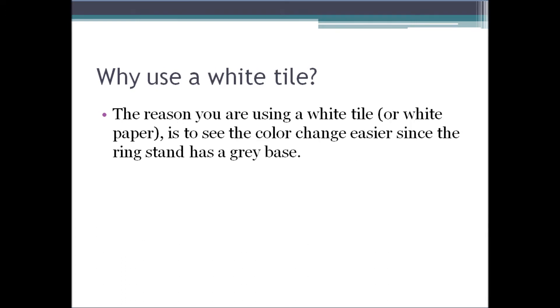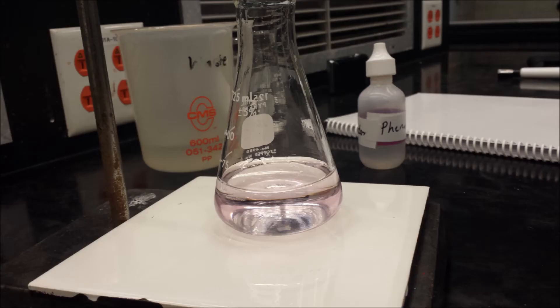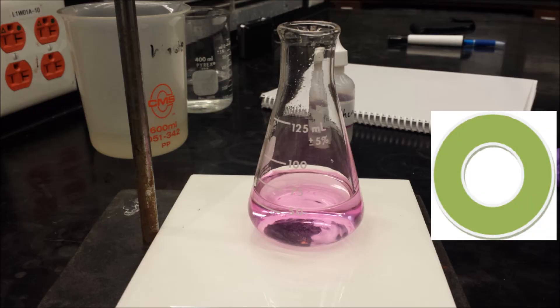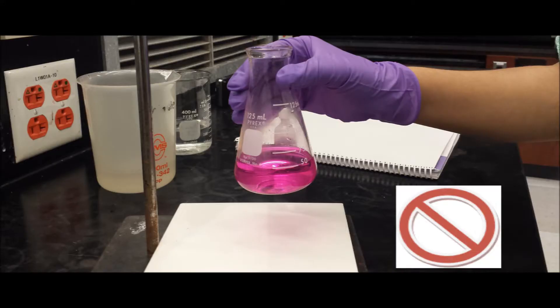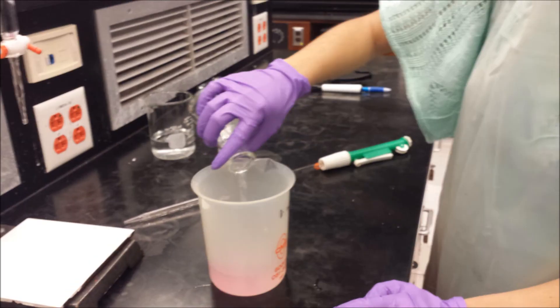The reason why you are using a white tile is to see the color change easier since the ring stand has a gray base. Stop the titrant when the solution is slightly pink. If the pink color does not disappear after 30 seconds of additional swirling, you have reached the endpoint of titration. If you get a dark pink color, a magenta, then you have gone too far and overshot it. Record your final volume of the burette to the nearest 0.01 milliliters and pour your titration mixture into the waste bucket.